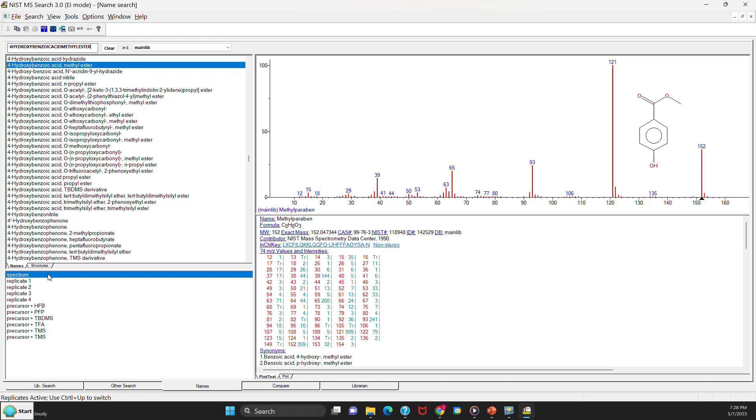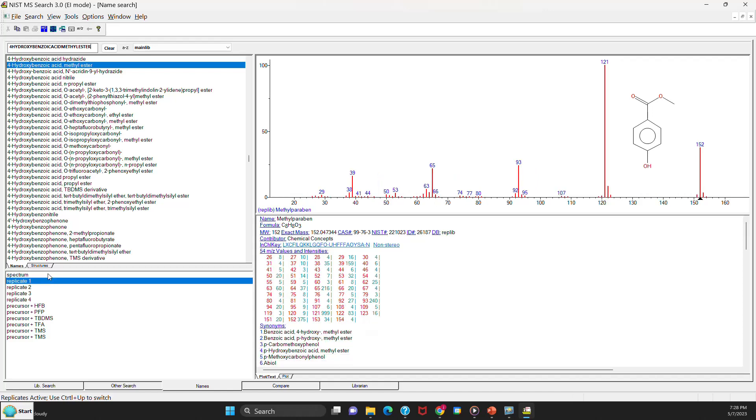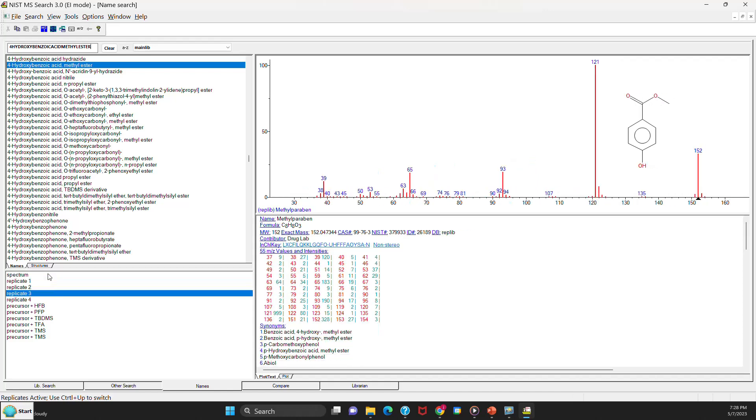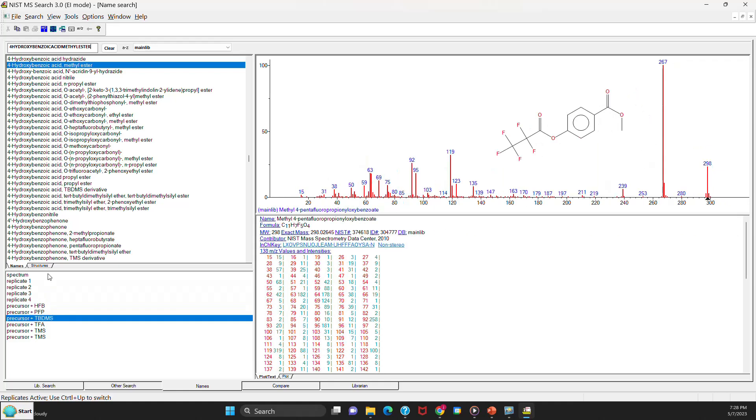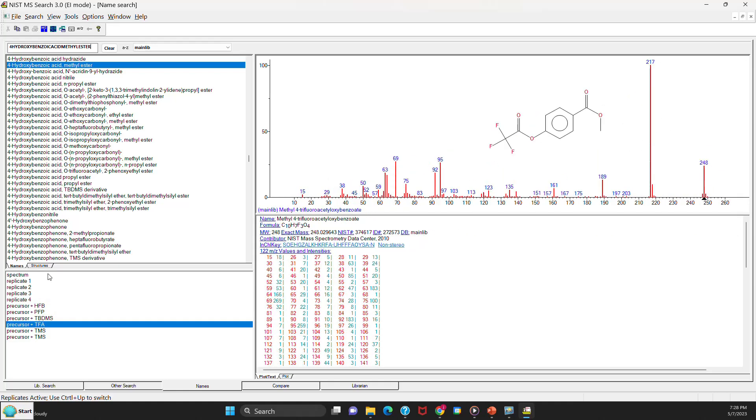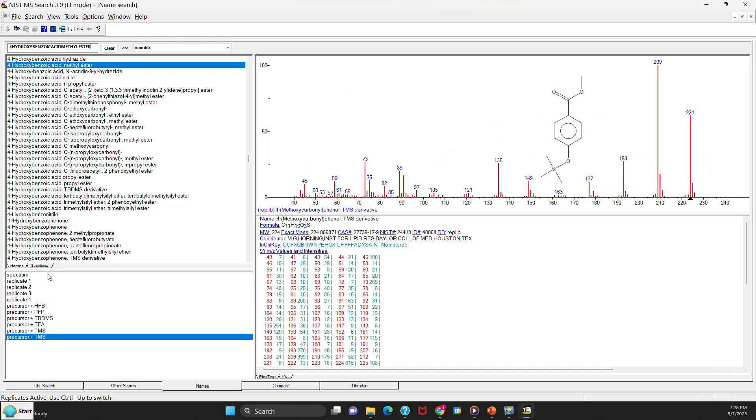But the other big improvement in the software, if you notice in the bottom window, it has the spectrum of the compound. But then it allows you to easily see the replicates for that compound. It shows the derivatives for that compound for all of them. So it's very useful. You can look at what derivatives might be in the library, plus to see the diversity in the mass spectra. However, sometimes NIST has picked the best spectrum, but sometimes that could be somewhat subjective. So it's nice to be able to see the replicates to see if you agree.